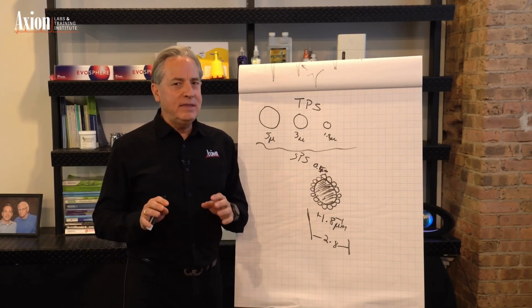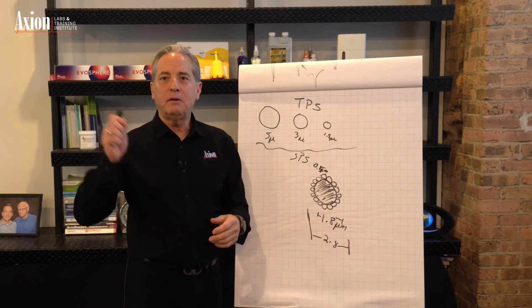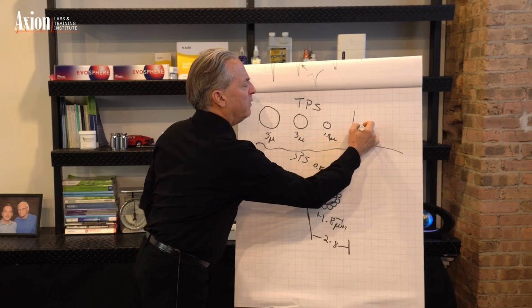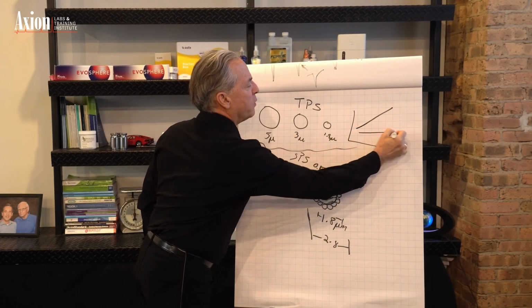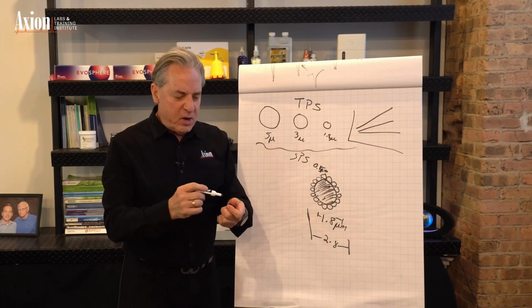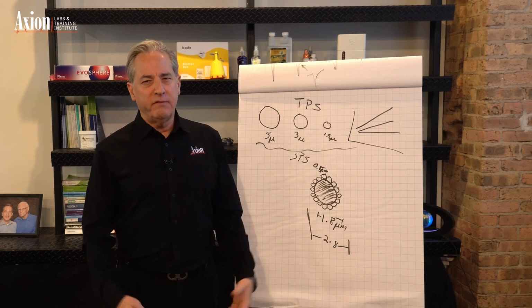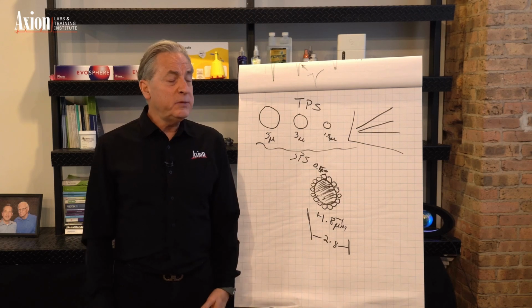In practice, it really does work pretty much that way. The pressures are exactly in between. In fact, we did a paper on this. We did a poster on this and presented it, I believe, at Pittsburgh Conference, where we showed the pressure of, I don't know, we'll call that the 1.8 micron. That would be the 3.5 micron, and that would be the 2.8. So it's right in between them. It's well within the pressure range of a regular instrument, and it gives you the higher efficiency of the small particles. So it is sort of the perfect world in HPLC.